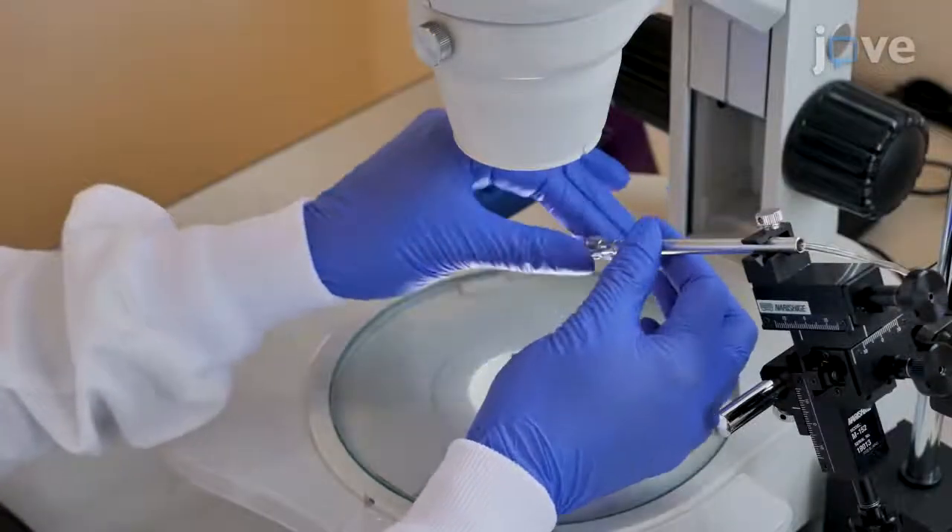Then mount the needle onto the micromanipulator. Aspergillus fumigatus is an opportunistic pathogen of humans, and there is a risk of skin puncture with the loaded needle. The needle should be very tightly attached to the microinjector, and researchers should always wear gloves and pay close attention to their hand movements.